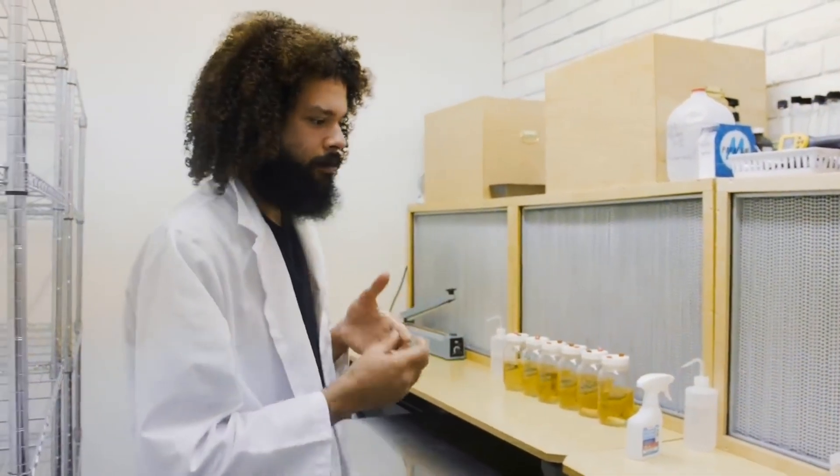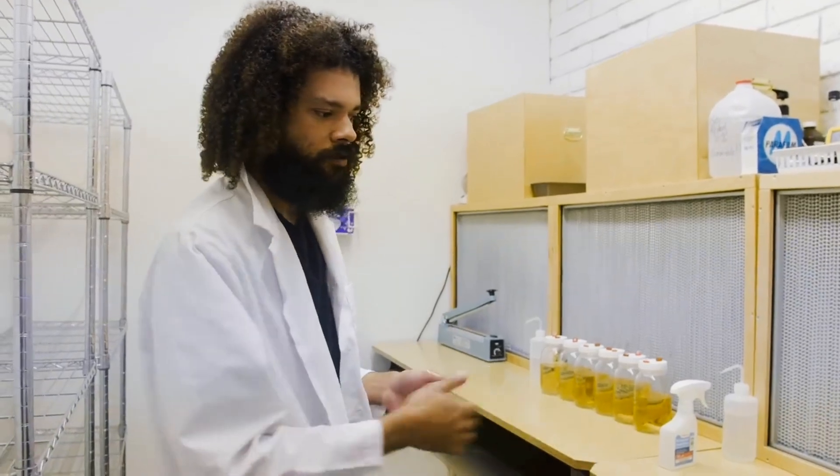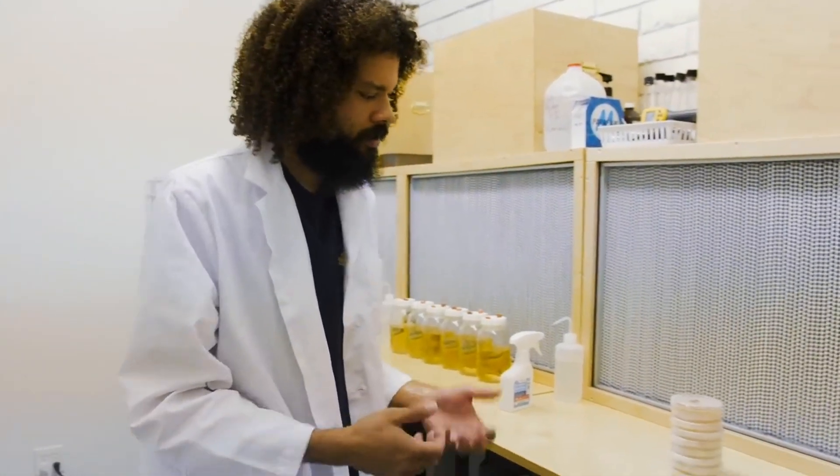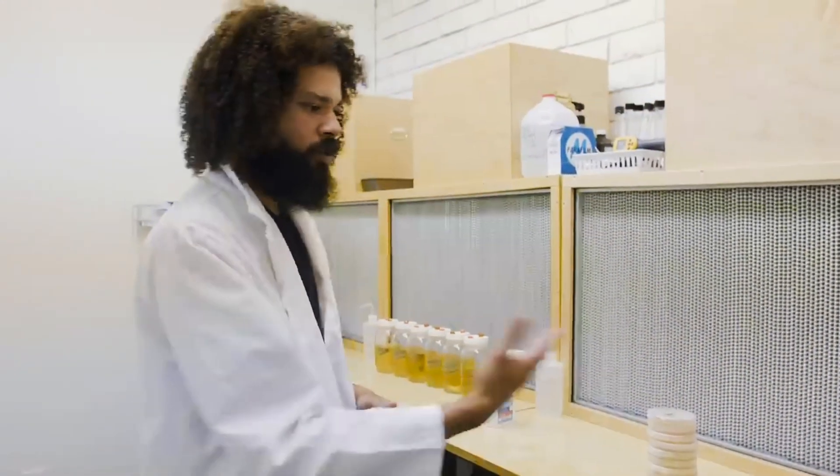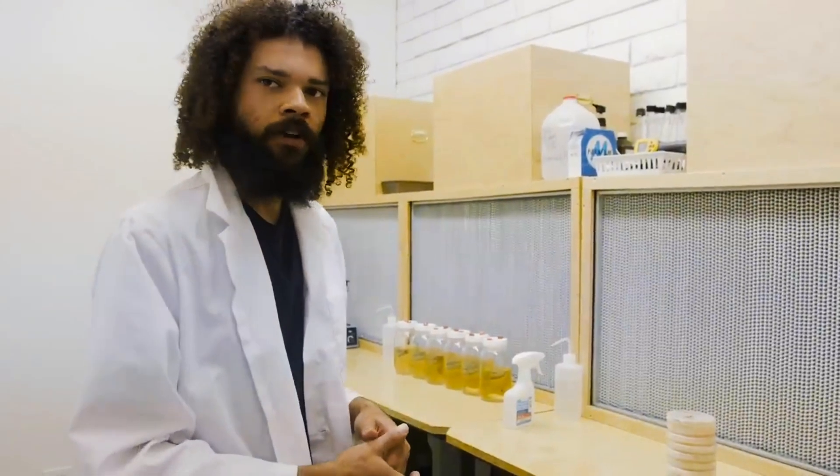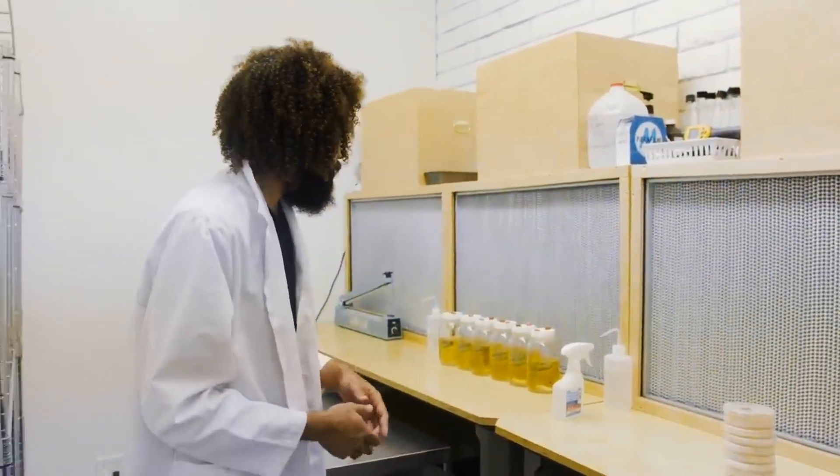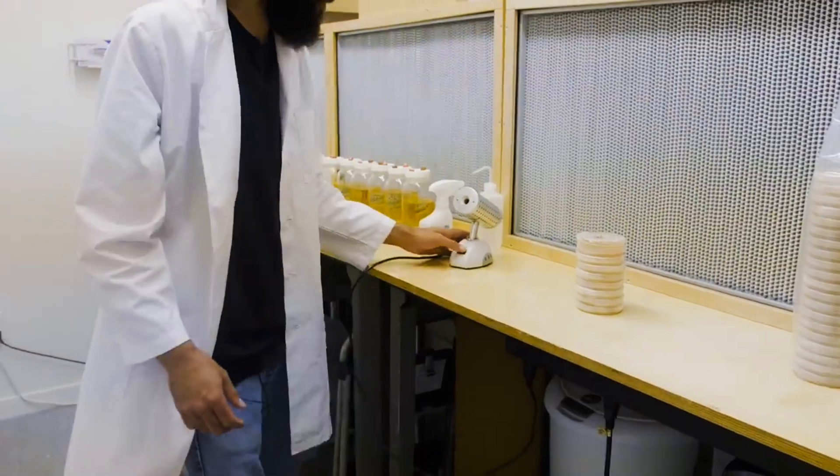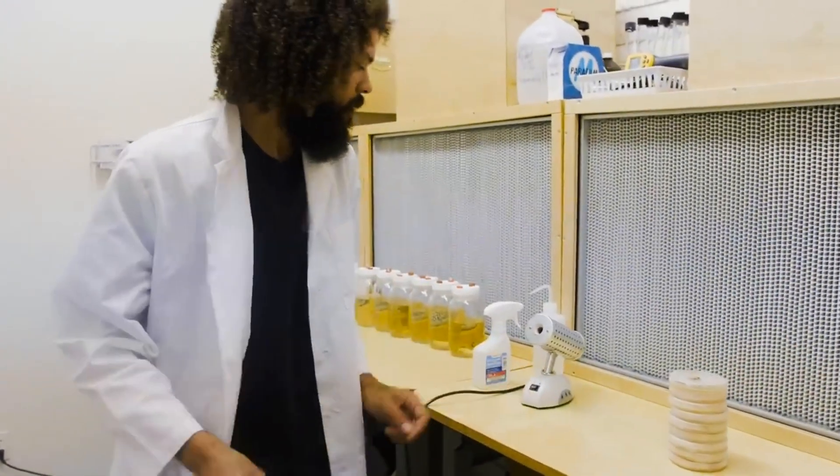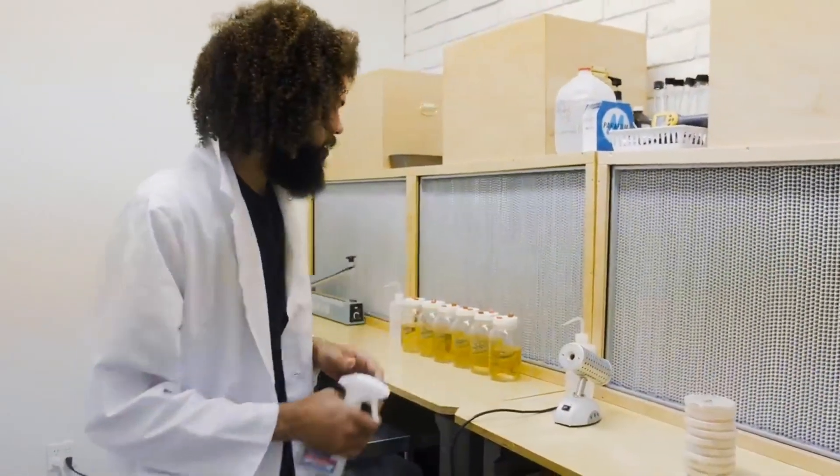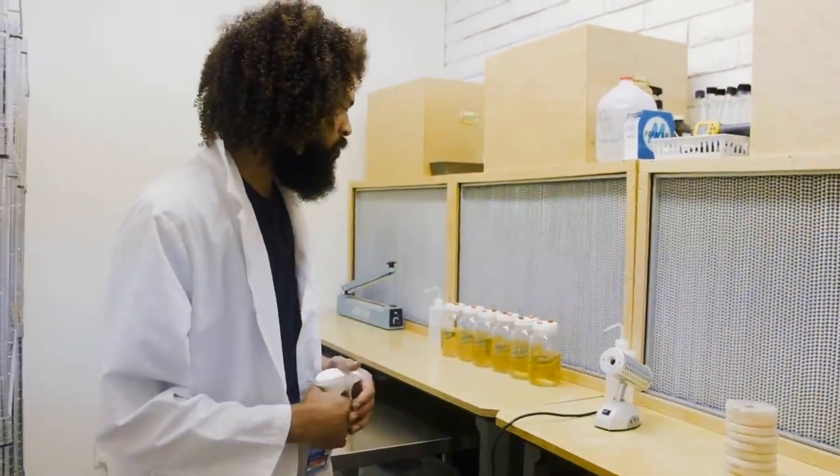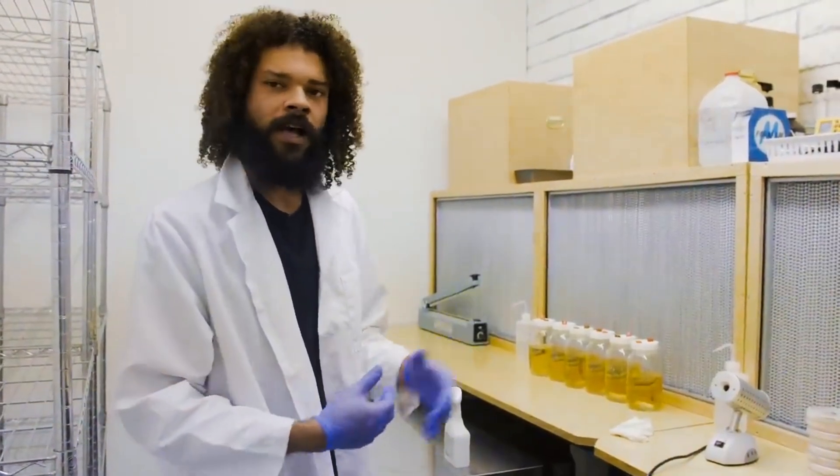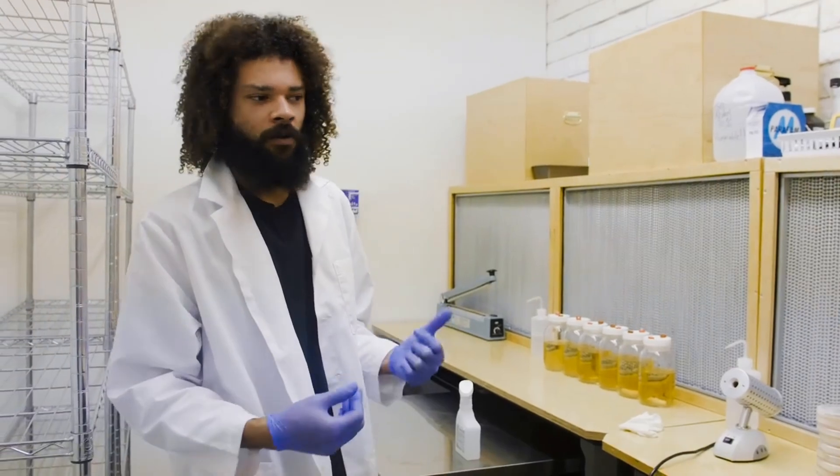So we're in our lab. We're gonna do some tissue transfers from petri dishes I've selected and transfer them onto these fresh plates that I've poured out. We have our bacticinerator, or transfer tool sterilization unit, to basically make an efficient lab space to do all your clean work.